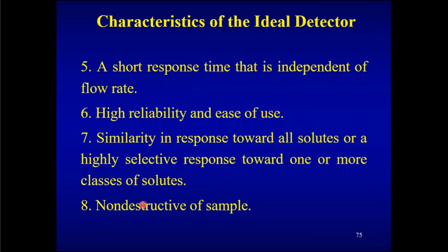And lastly, the detector should be non-destructive of the sample. After the sample passes through the detector, if it is still retained in its original form, then it can be used for any further study. But if it is destroyed, meaning there is any change in the sample, then it has to be discarded. So this is also a desirable feature of a detector.